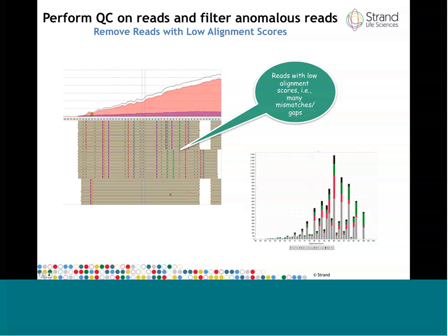It appears as if the number of mismatches and gaps is way too many to allow for the possibility that some sort of sequencing error or mutation distance between genomes was responsible for this. This is probably just bad mapping.